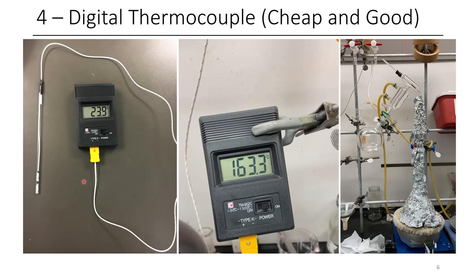So with alcohol thermometers or even with mercury ones, you get a bit of latency. Mercury is definitely better in terms of less latency. But in the case of the thermocouple like this, it's just super easy.